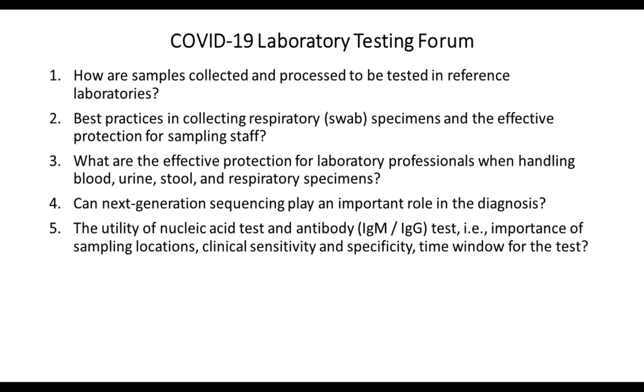Okay, thank you. Hello, everyone. I'm Dr. Jiang from Dian Diagnosis, which is the largest independent clinical lab in China, just like LabCorp or Quest in America. I'm now working on the virus detection of the clinical trial of remdesivir. As most of the samples we are handling now are positive samples, I think maybe we have something useful to share with you. Firstly, I have to remind you that this virus is a very, very terrible virus. It's not just like a big flu. So you should pay attention to every detail during your work.